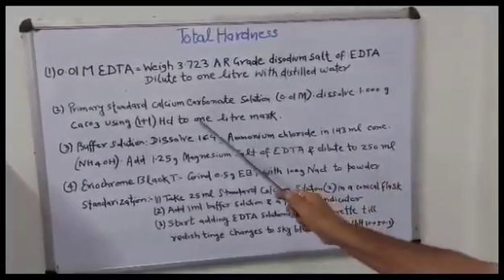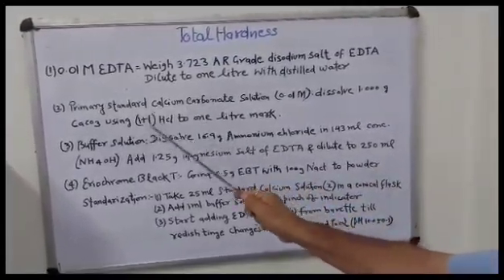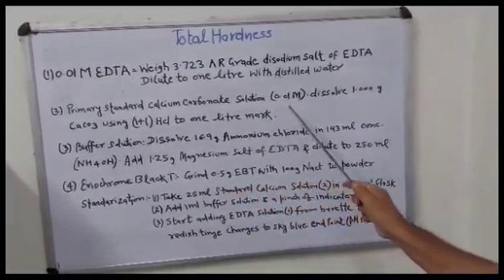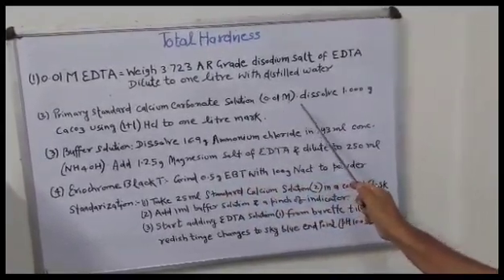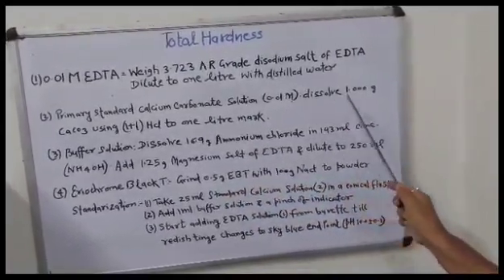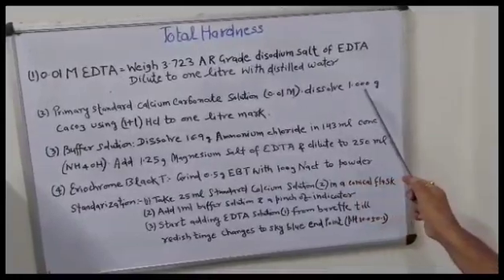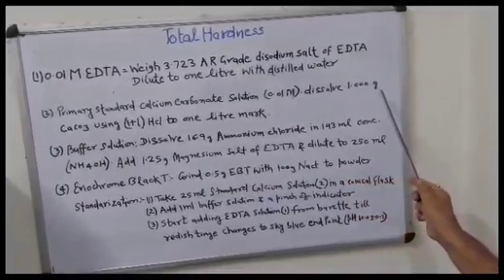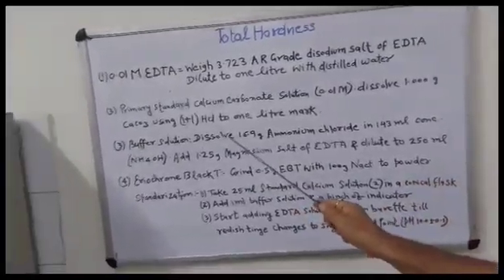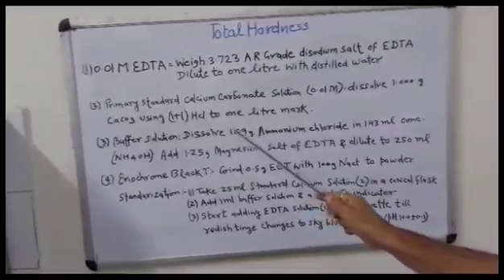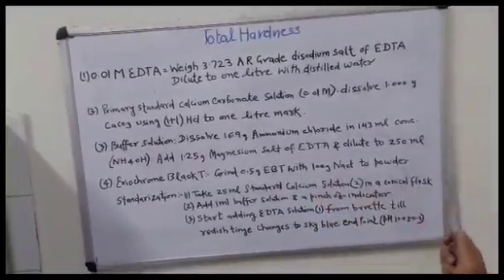We have to standardize EDTA with primary standard calcium carbonate solution, also 0.01 M. For that, dissolve 1.000 gram calcium carbonate using 1+1 HCl, and make up to 1 litre mark.